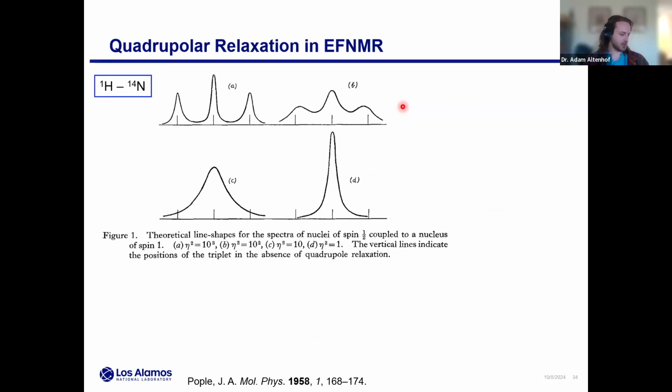Now, if we're thinking about detecting illicit materials in general, we have to recognize that nitrogen is almost always present in most of these materials. So if you're not familiar with this, if you have J coupling from proton to 14N, what you're going to see is a triplet because of the spin 1 14N nucleus.